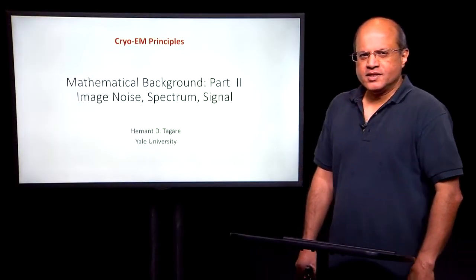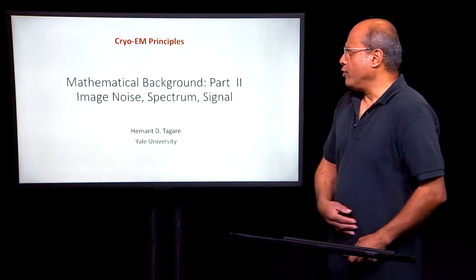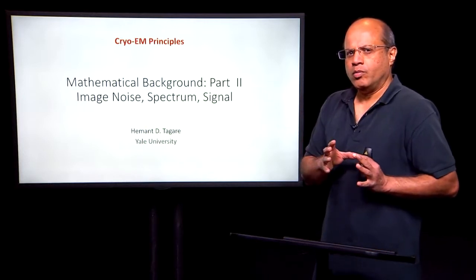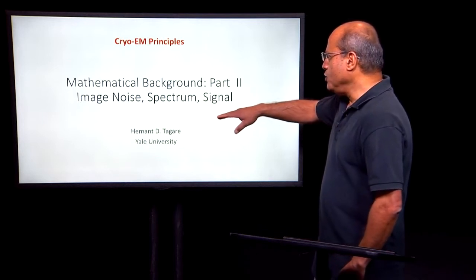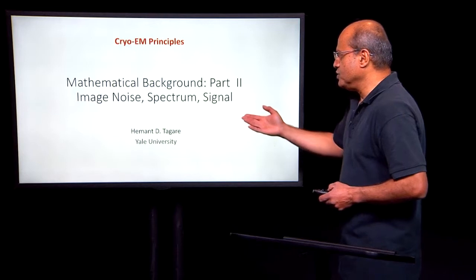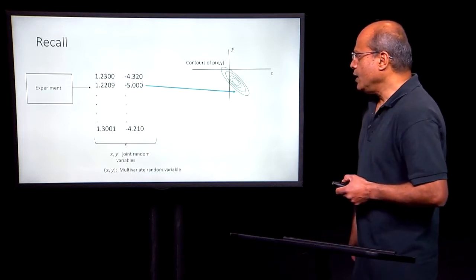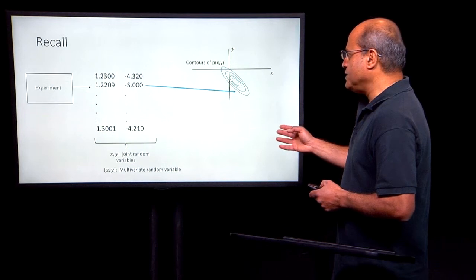All right, so this is part 2 of the mathematical background for CryoEM single particle reconstruction. What I'm going to do is draw from what we did for random variables in part 1 and use that to create models for the noise in CryoEM images, talk about their spectra, and say a little bit about the signal in the images. So let me just begin by recalling what we did last time.